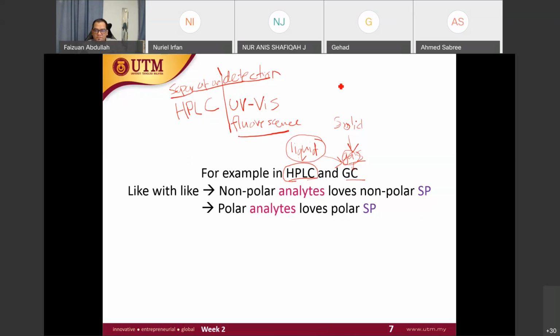Now we have GC. For the detection, can anybody give me an example, if you have heard previously? We have MS. What is MS?